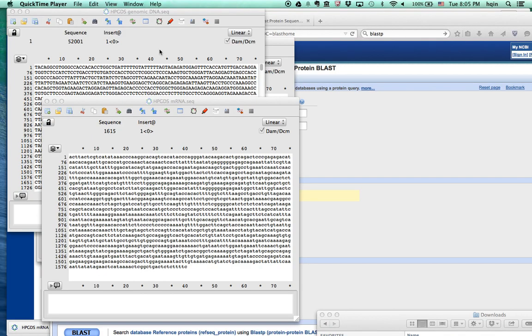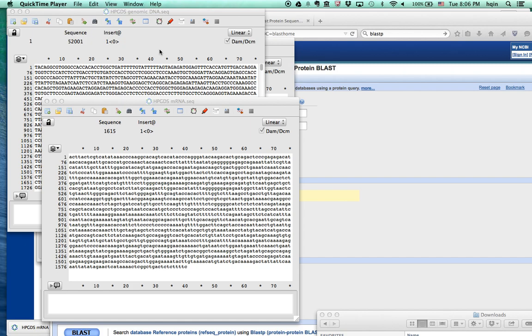This video will demonstrate how to use APE to align genomic DNA sequences with mRNA sequences. This alignment can be used to find out the structure of the genomic DNA, like how many exons and how many introns can be located. We will then do some exercises to find out which ATG is the appropriate ATG for the start of the ribosomal translation.